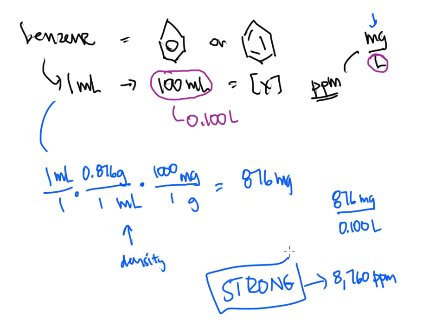I'm going to, again, eat through those solvents, but that's just the way this is playing out in the GC world. And in addition to that, I have made super strong solutions that need to be run. So this 1 mL, not going to cut it.